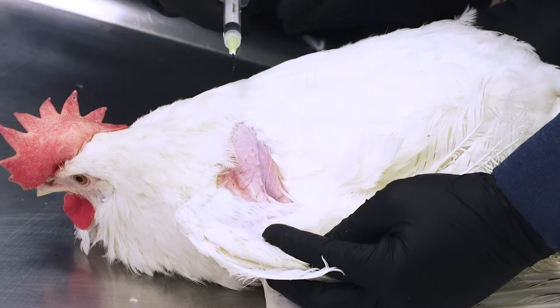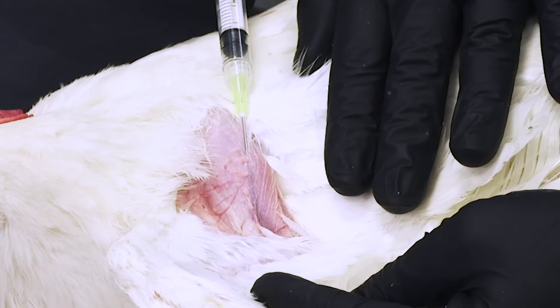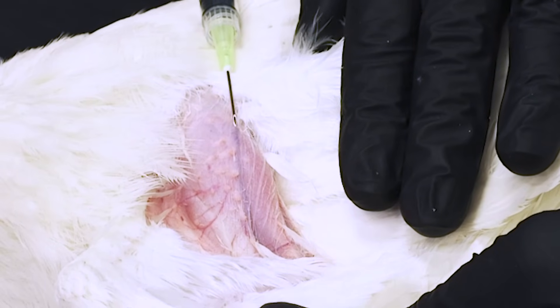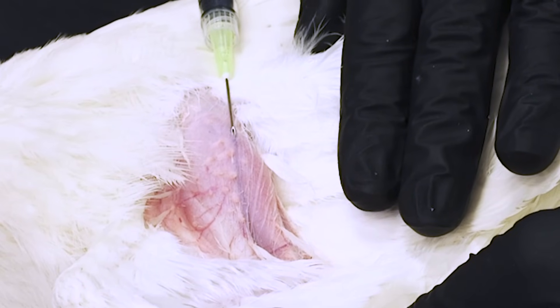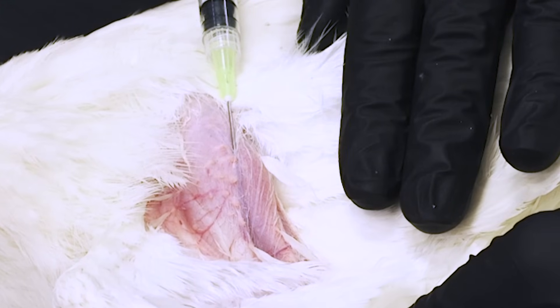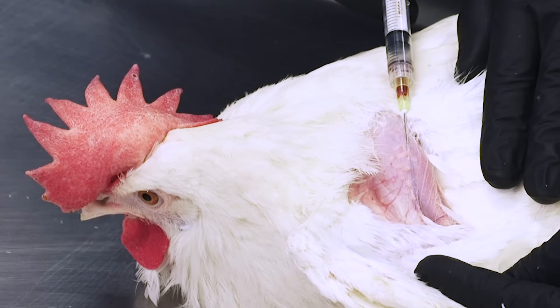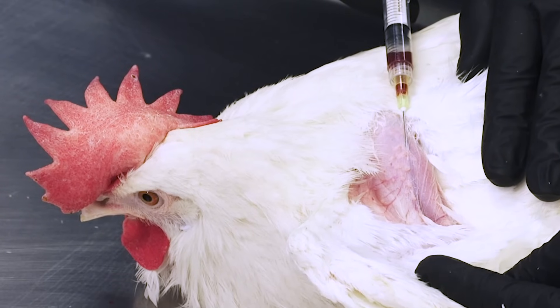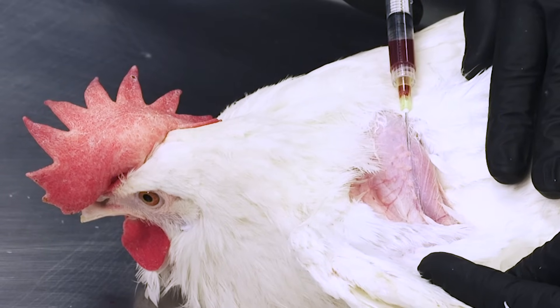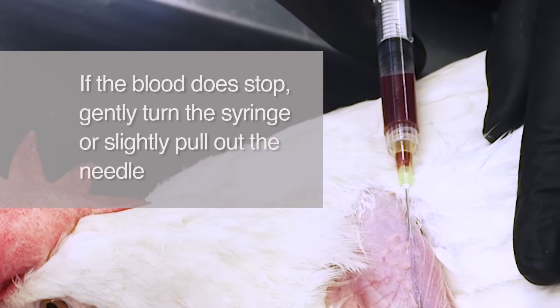As the assistant restrains the bird, the other person inserts the needle. Withdraw the plunger slightly to break the seal and create a small vacuum inside the syringe. To take the sample, insert the needle using a very shallow angle, nearly parallel to the skin, with the bevel facing up, and avoid going through the feather follicles. Slowly pull back the plunger, allowing it to fill with the proper amount of blood — but not too fast, as this may create too much vacuum and cause the wall of the vein to collapse, stopping blood flow. If the blood does stop flowing, gently turn the syringe or slightly withdraw the needle.